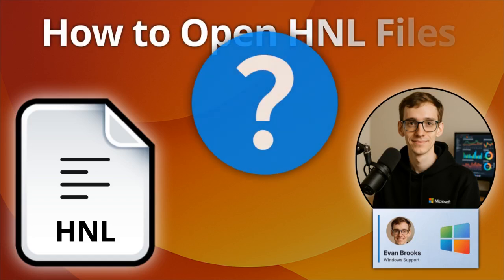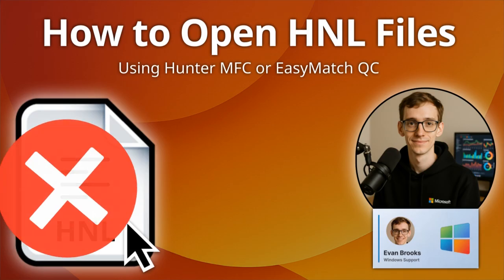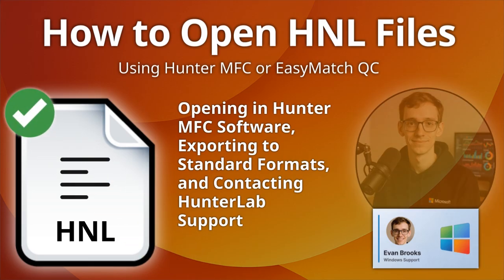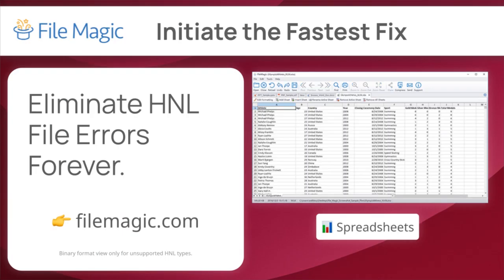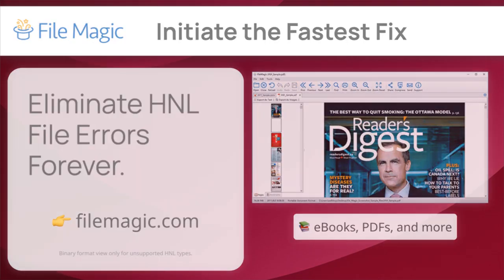Working with Hunter MFC equipment data and inherited an HNL file, this format stores measurement data from HunterLab instruments. I'm Evan Brooks, Certified Support Engineer, and I'll guide you through opening these Hunter MFC data files. I call this the last resort solution for those HNL files that seem completely unopenable. We'll explore that powerful alternative if the standard procedures fail.